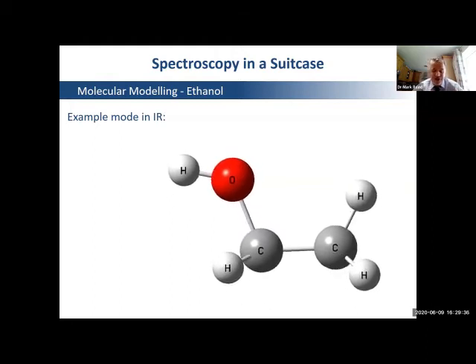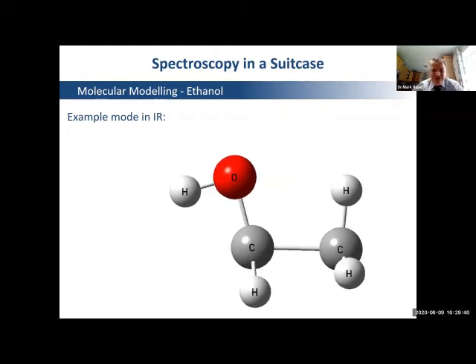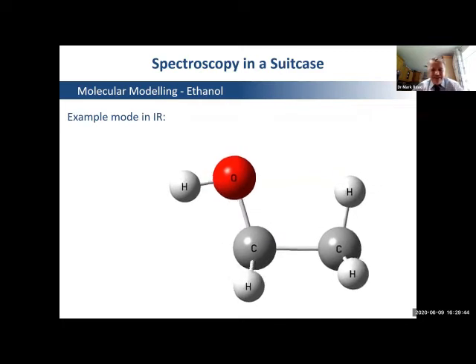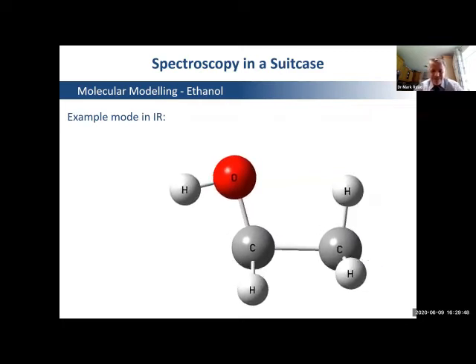Then in the classroom, we usually go in and we say that an unknown white compound has been found in a student's locker and we need to analyze it rather rapidly. So this is the scenario. Now I'm going to show you how we can actually run that sample.